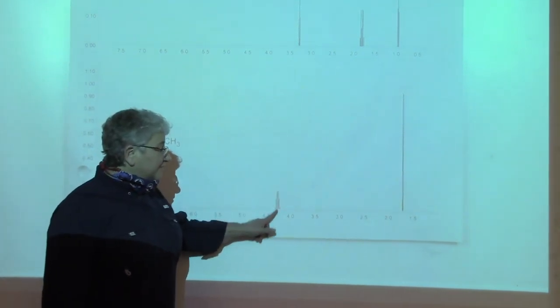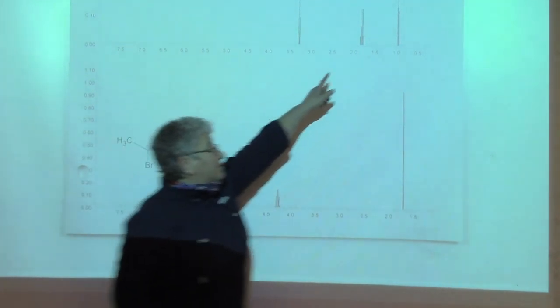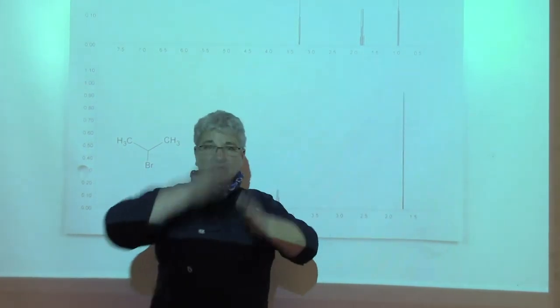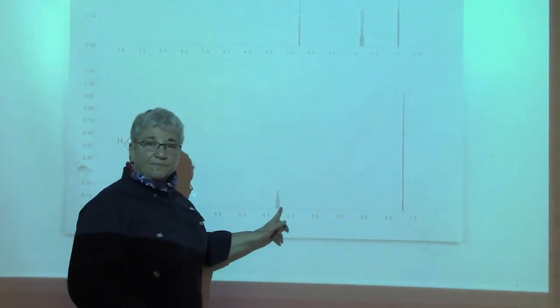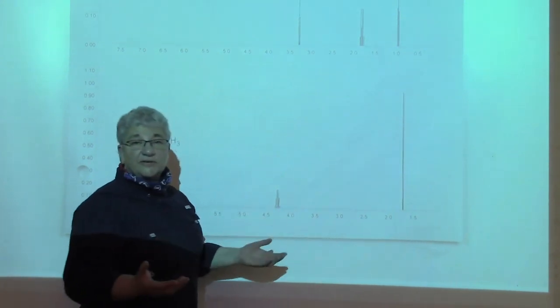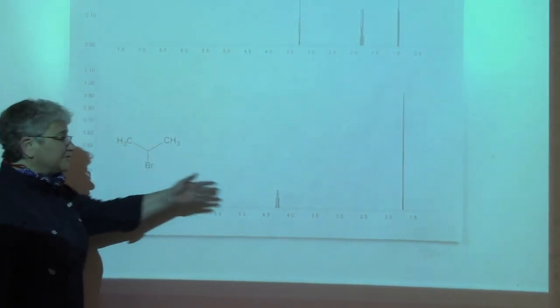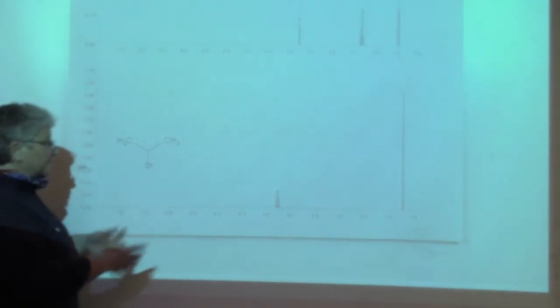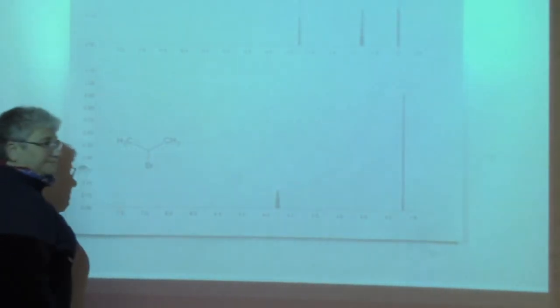And you can see that this pattern is really much nicer than this pattern. This pattern is a multiplet. We have tall peaks and little peaks, and nothing that really looks like a nice pattern. This clearly looks like a nice pattern, and you could call it a multiplet, but if you look at it closely, you can see it's a septet. You can see that it's going to make sense. If you see a septet, start to think, oh, that was 6 hydrogens that are equivalent. That's 2 methyl groups. That might be an isopropyl. But anyway, even if you call this a multiplet, that's fine.